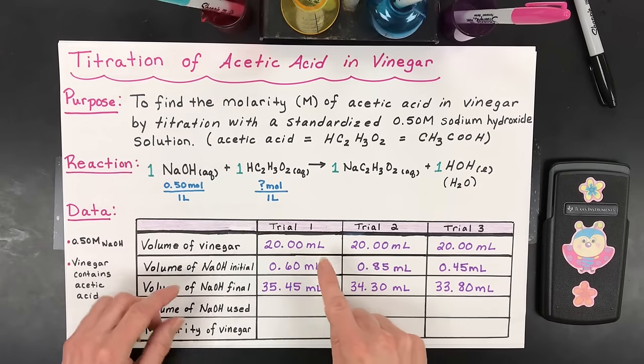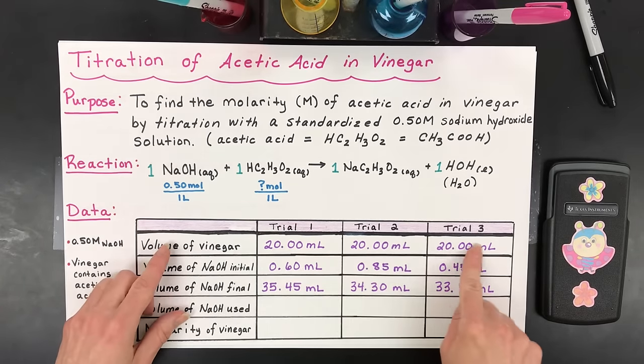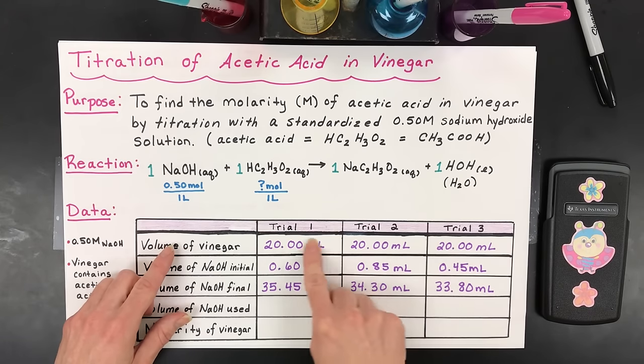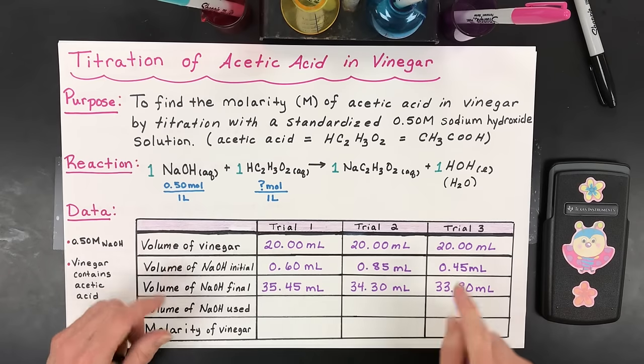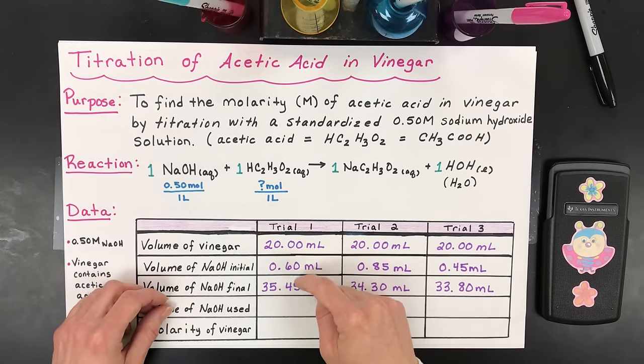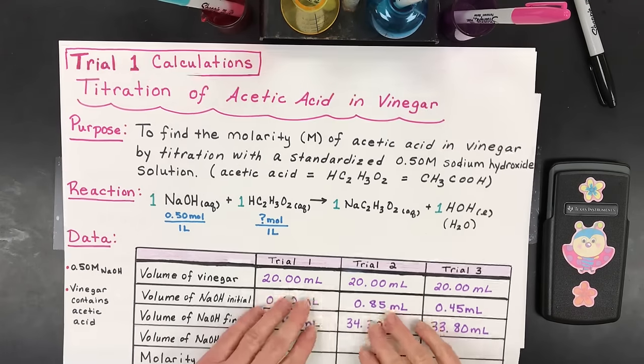So here's my data. I ran two more trials. You might have to do that also. I kept my volume of acetic acid or vinegar the same, exactly the two decimal places. I used a graduated pipette. Then I have an initial and final volume for each one of my trials. So here are the mathematical steps you're going to need to do to solve for the molarity of vinegar that you'd put in each one of these trials.